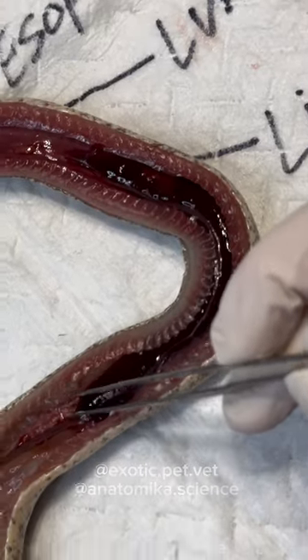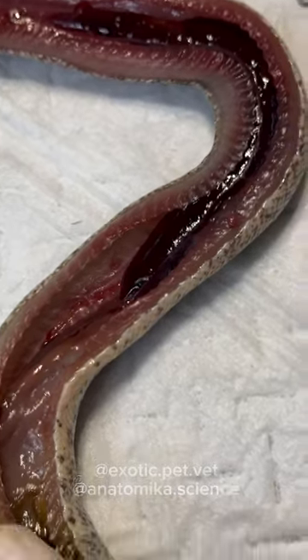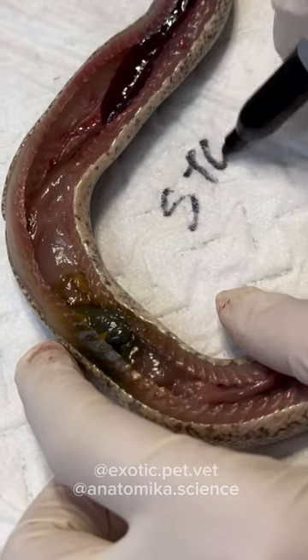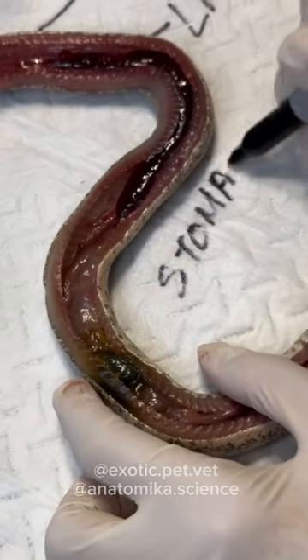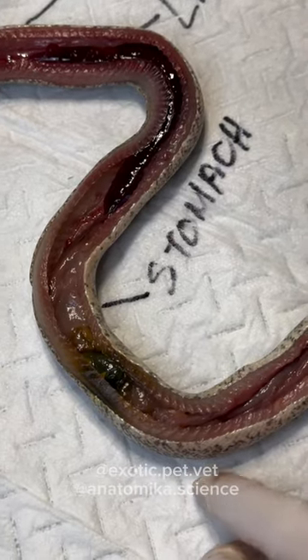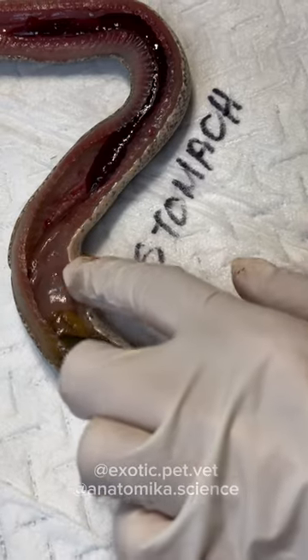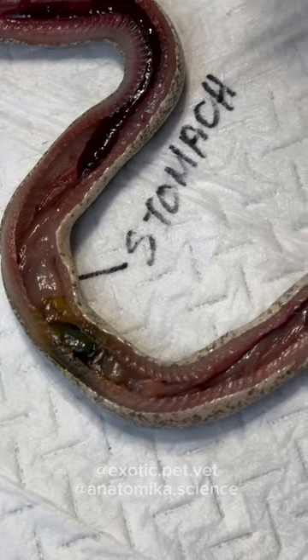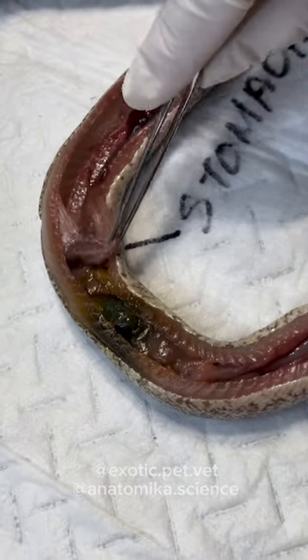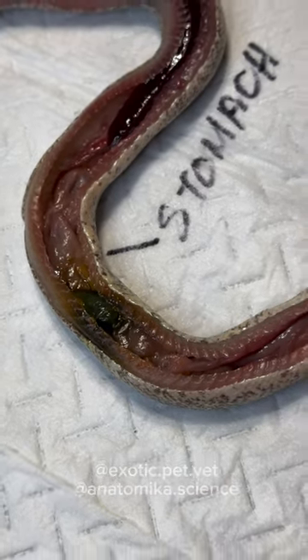Past the liver you have more lung. And then we have the stomach — it is empty, but it's pretty big, so you can see how they can fit in a nice rat or mouse. Very stretchy organ.